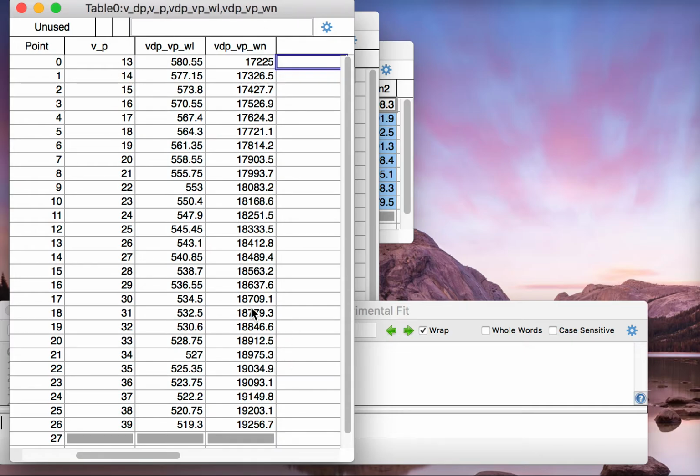In this table you can see the notation V_P stands for V prime. This data set is all starting at the ground vibrational state 0 and going to various levels of excited state vibrational levels. Again, that's ground electronic to an excited electronic level. The next column is the wavelength in nanometers taken from the data acquired in the lab, and then that wavelength is converted to wave number in units of inverse centimeter. All the data described here will be in units of inverse centimeter.